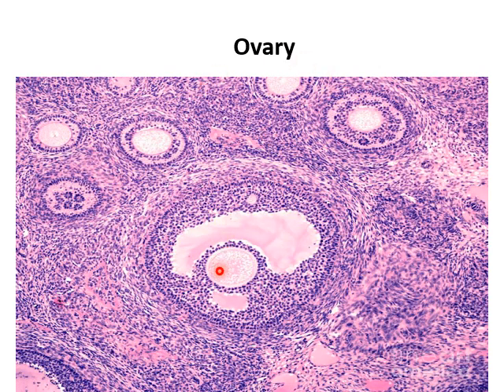Ovary. You can see the ovary is formed of outer cortex, which here in the slide, the cortex is eminent, the inner medulla is vascular, the outer cortex contains many ovarian follicles. Okay, this is primary, this is secondary ovarian follicle.